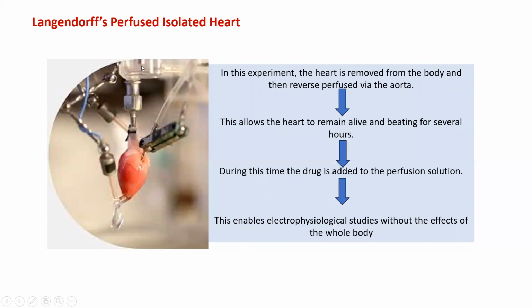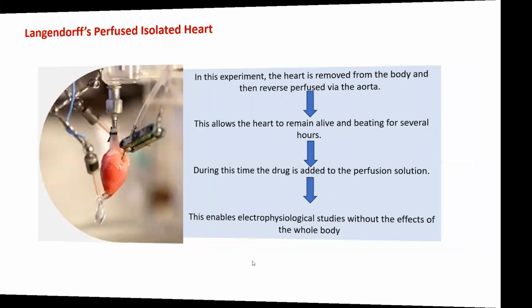So in this perfusion solution, the test compound is added and electrophysiological recording is carried out. And from that, it is observed whether the QT interval increases or any change takes place. An electrophysiological study without the effect of the whole body can be recorded.